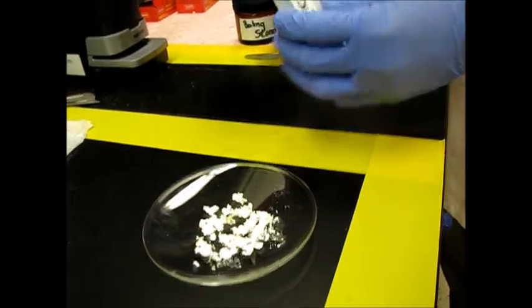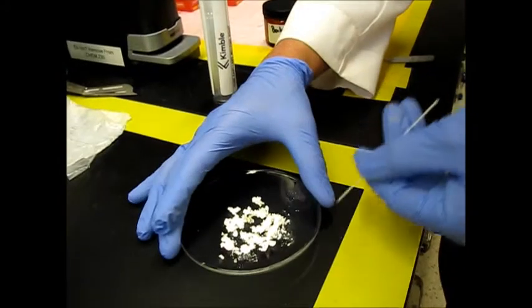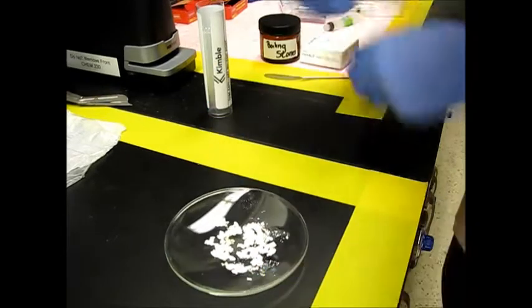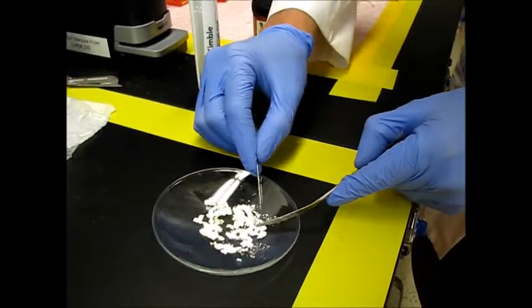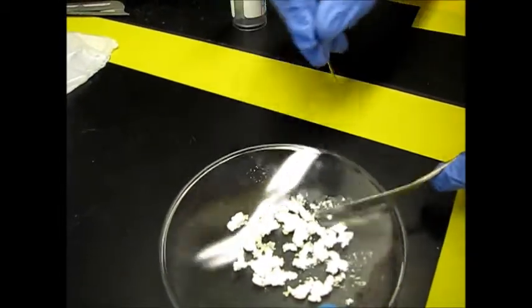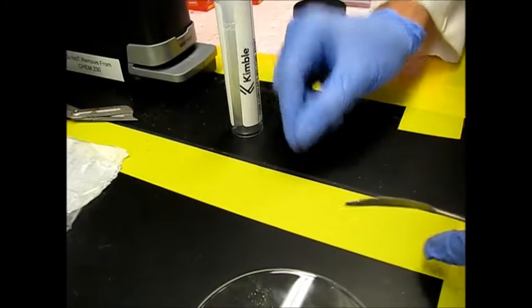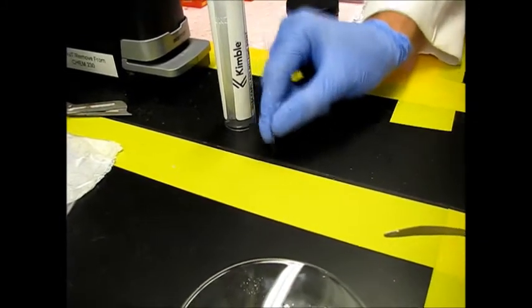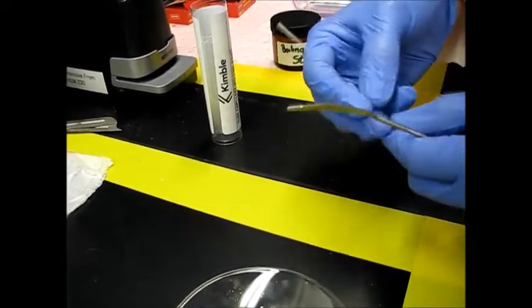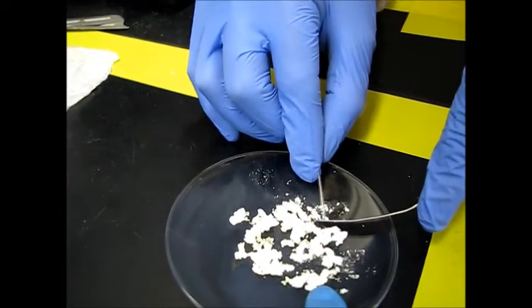So we're going to grab one of our capillary tubes. The best way to do this is you want to shovel it in, scoop it in like this. It might be easy to have this here so that you can actually press it in. Once you get a little bit in, you want to tap it in. And then you want to scoop a couple more times just so that you get a good amount of product into your capillary tube.